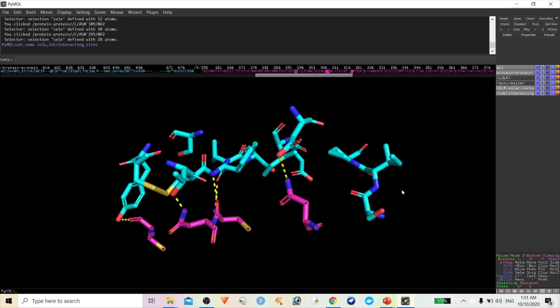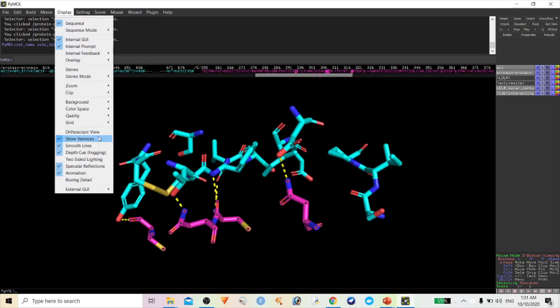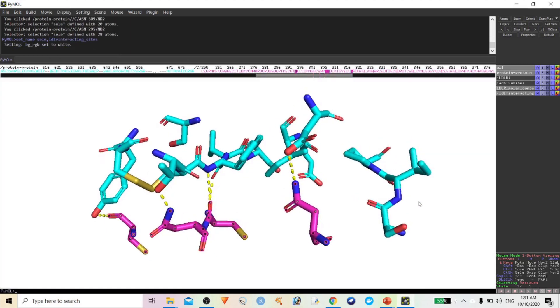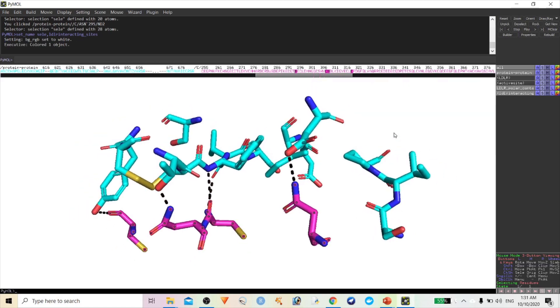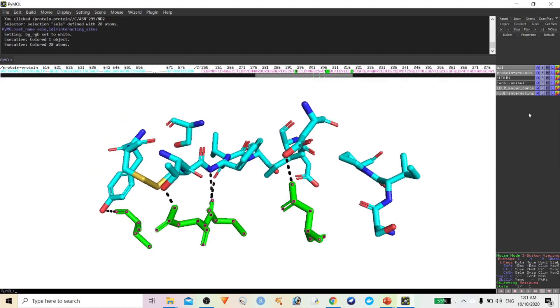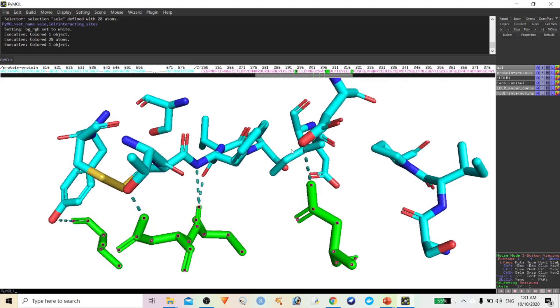For publication mode, it is better to have a white background, and you can change the color of the hydrogen bond interactions. You can change it to black or whatever color you want — you can change it to different colors for these interactions.